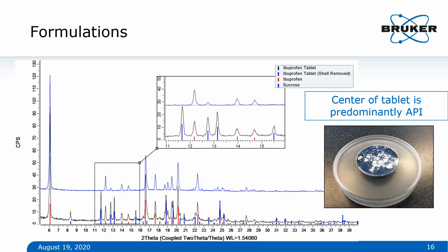And then visually you compare them, or you would create a set of peaks, and you would say, yep, the strongest 7 or 8 peaks are present. They are in the right location. They are there in the right relative intensities. We can confirm that we have the right material. But is it necessary to run that standard every time? Probably not, but your own quality processes will generally dictate whether or not you need to do that for each batch.